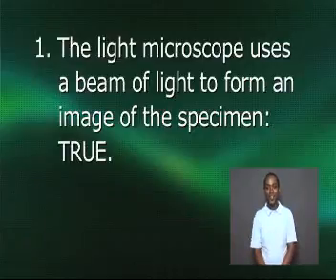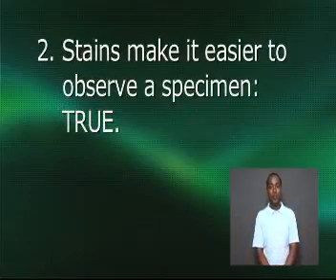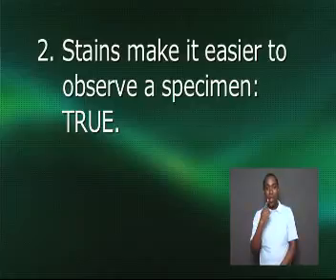The light microscope does use a beam of light to form an image of the specimen. Stains do make it easier to observe a specimen.